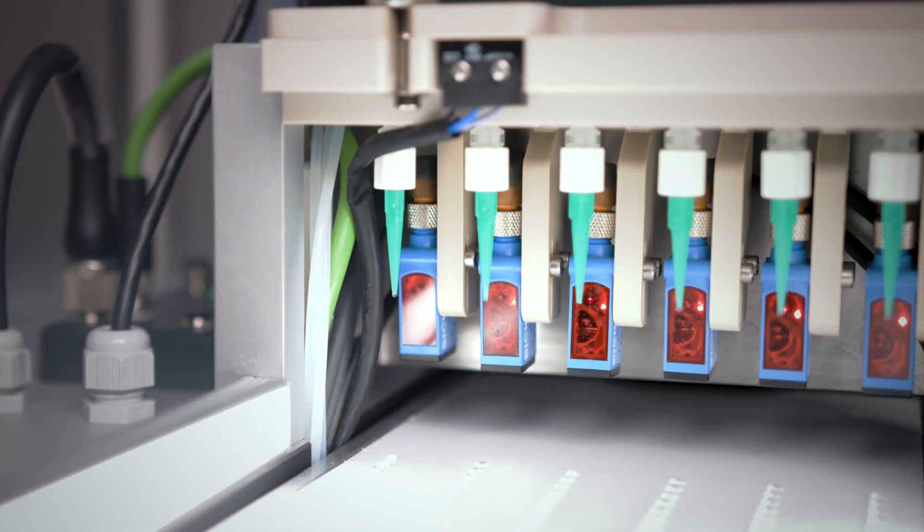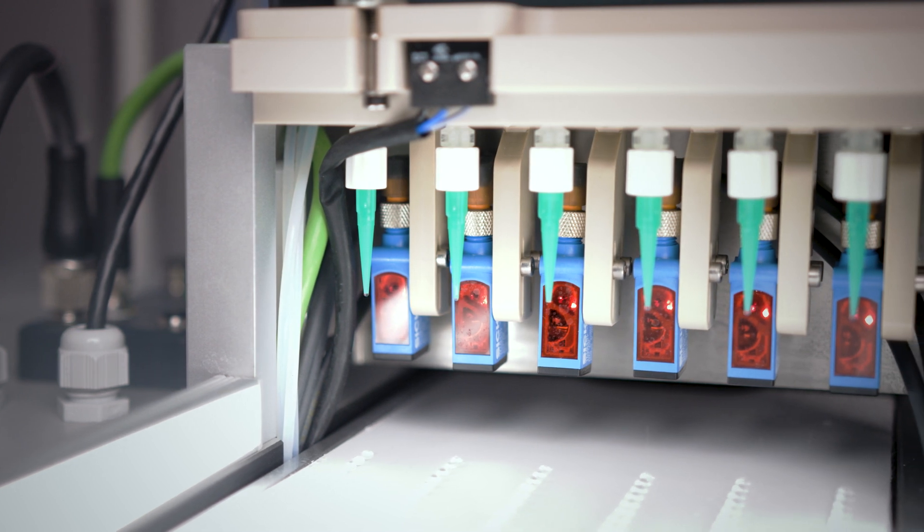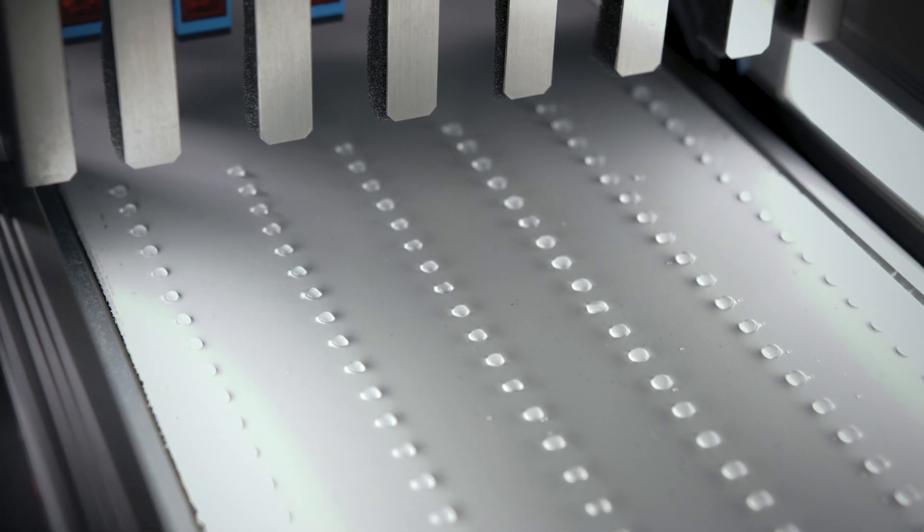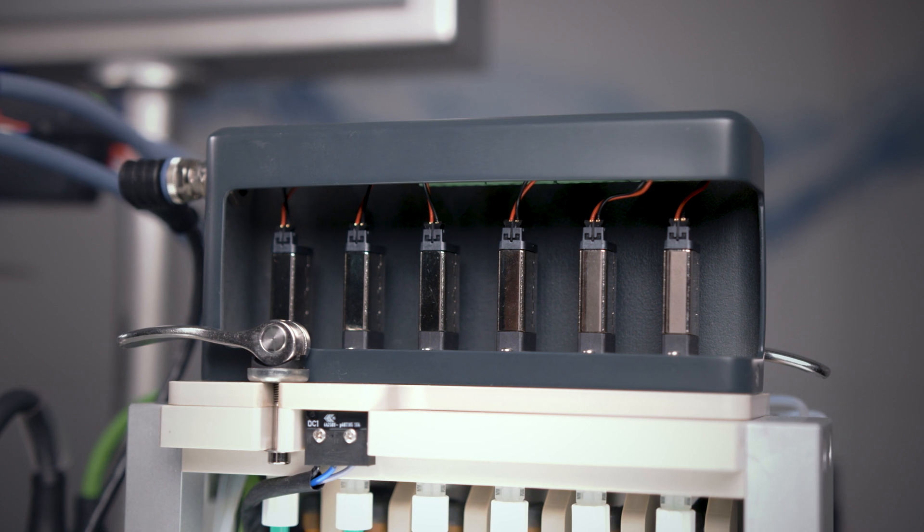Precise pressure regulation is essential, even for low flow rates. Reproducible, reliable synthesis of the individual nucleotides, for example, is crucial for high-quality primers.